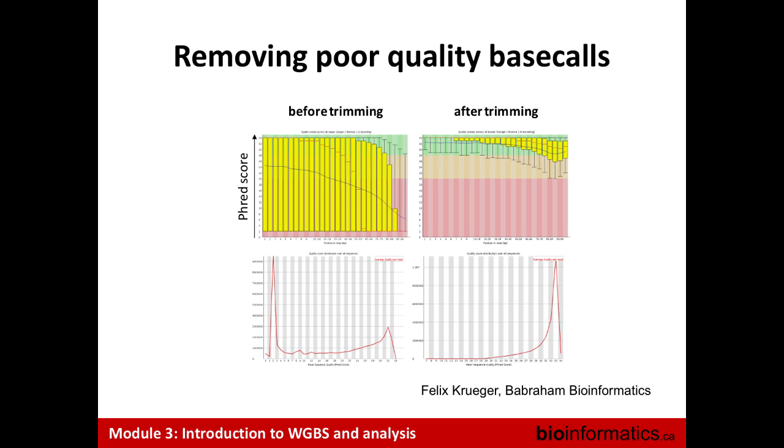Because even if you just retain the good reads, there was clearly some problem with either the sample preparation or the sequencing. But definitely, it still might be better than not using it at all, but it's good to take a look at the underlying data.